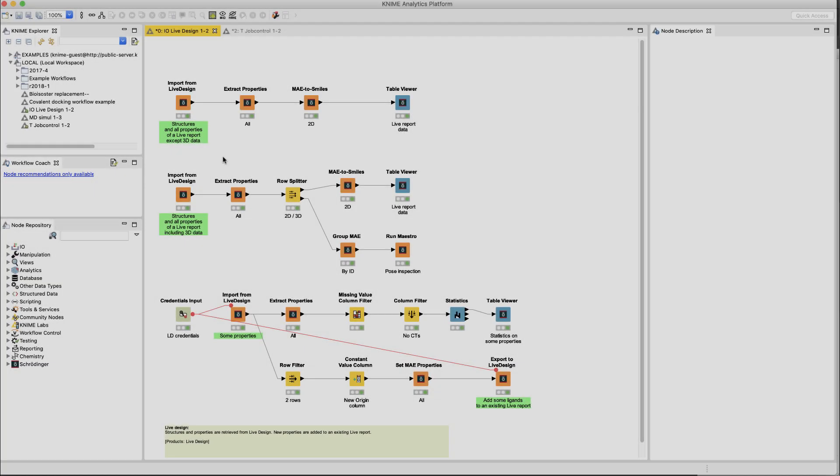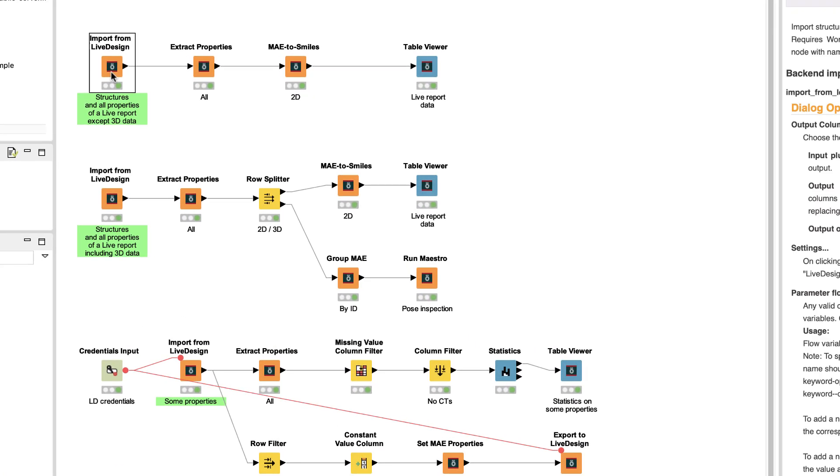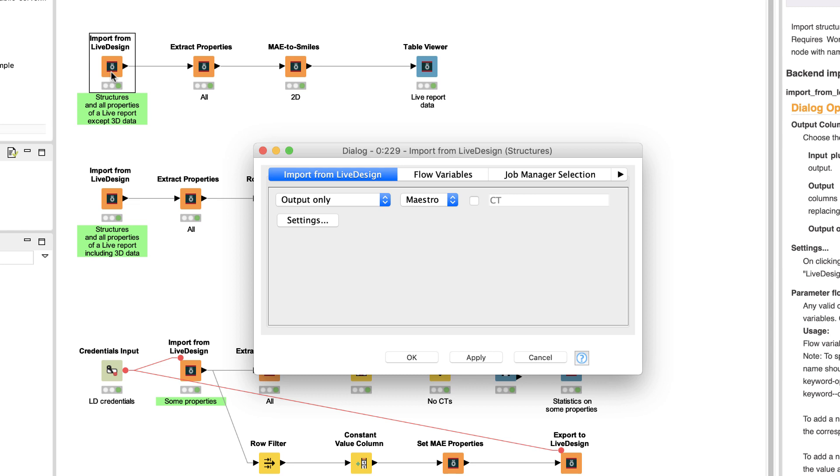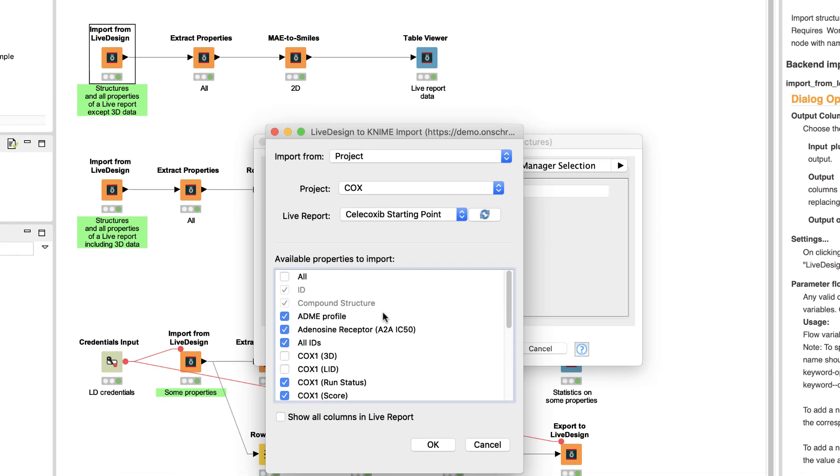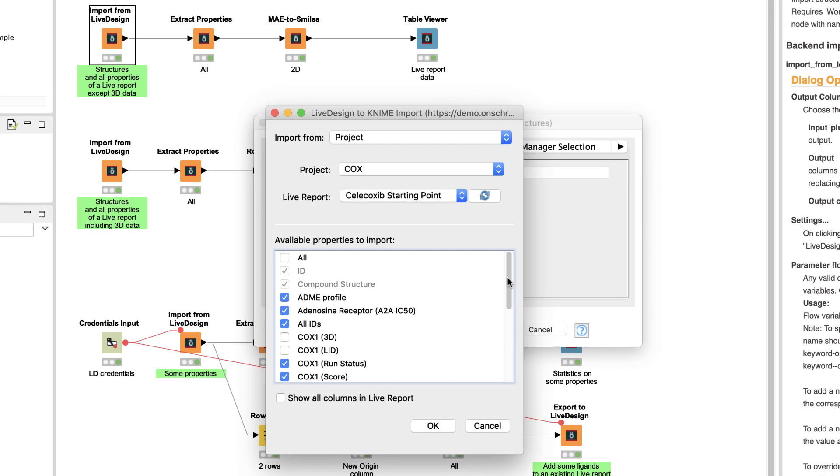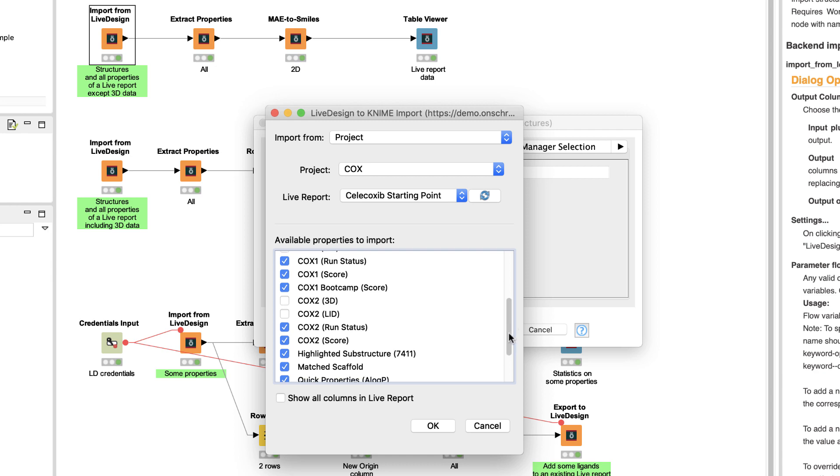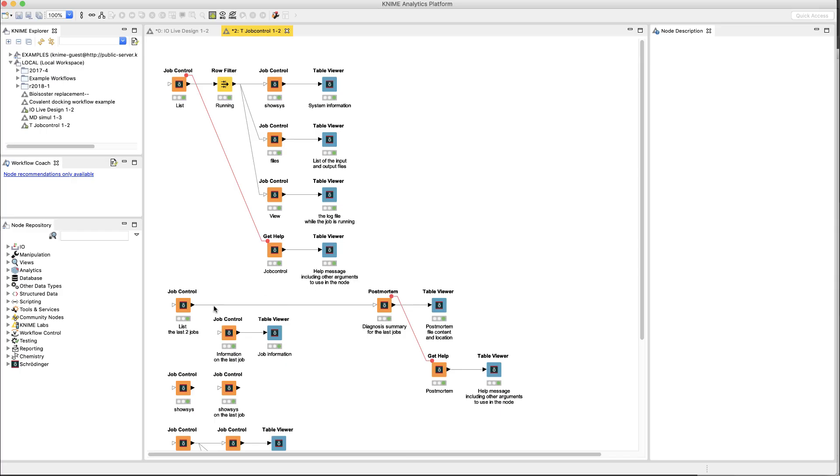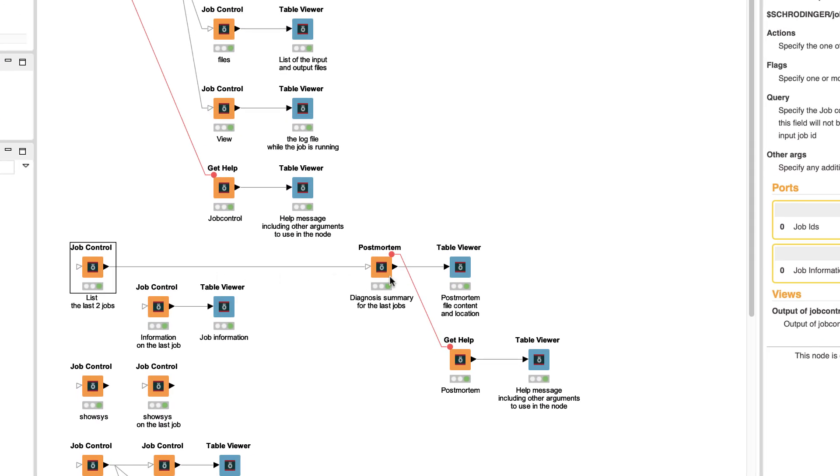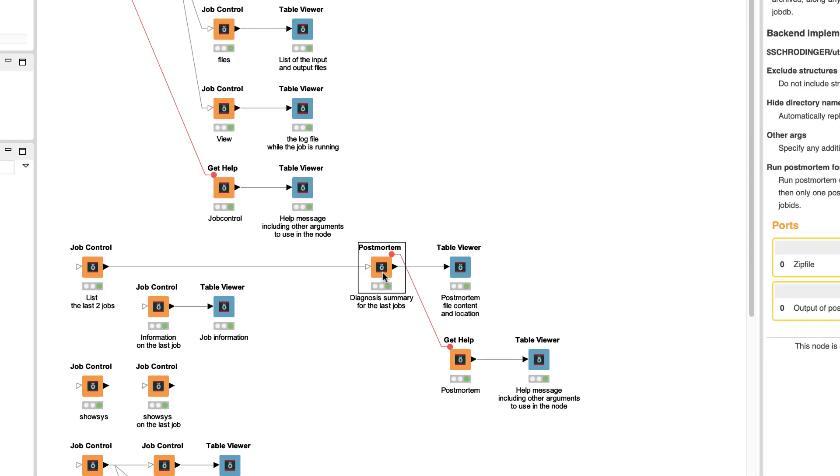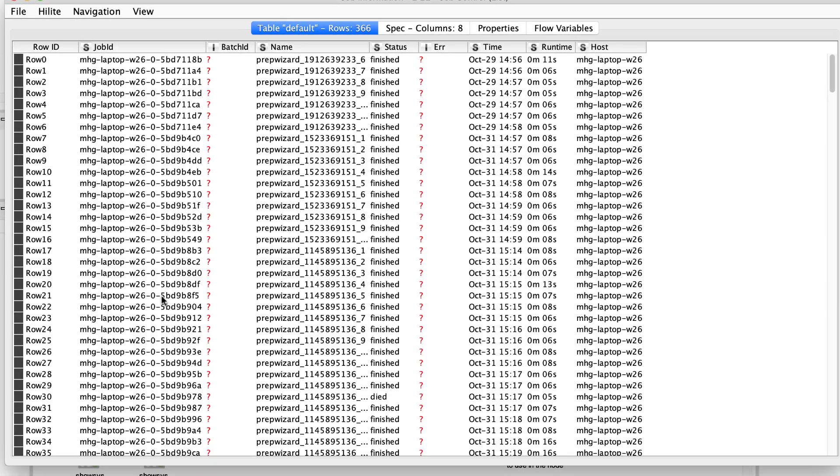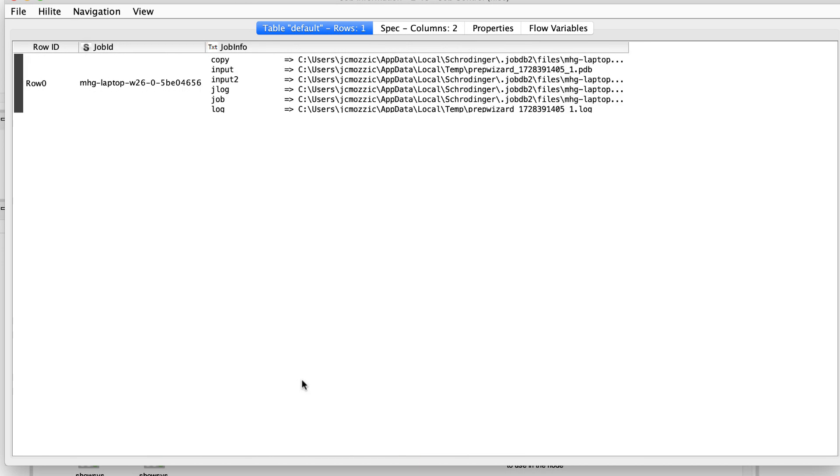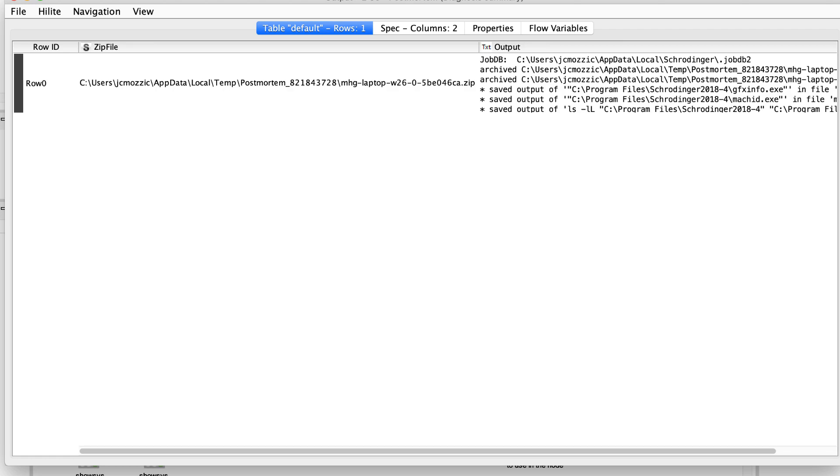And finally, over in KNIME, we see a new node for importing structures directly from LiveDesign, done with the same familiar panel as used in Maestro. And there are new job control and post-mortem nodes. These can be used to inspect the status of a calculation when running, as well as displaying job information, help messages and archiving files.